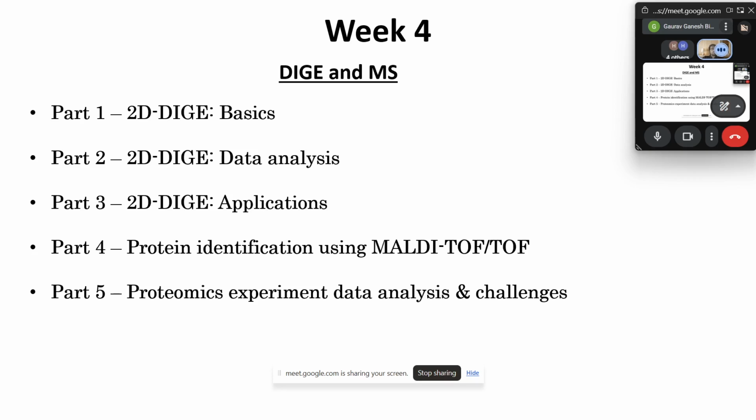In this week 4 lecture, we'll be majorly dealing with the DIGE technique only and a bit of mass spec. There were 5 lectures uploaded for the same, wherein the first part was about the basics of what the DIGE technique is all about. Then how can we analyze data using DIGE? If we have done the DIGE technique, how do we analyze the data after obtaining the results? And a bit of case studies and applications of what DIGE can be used for. It will have similar applications to the case studies we have done for two-dimensional electrophoresis, but in a different way.